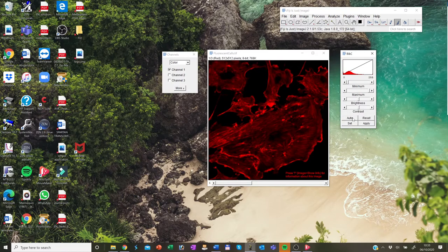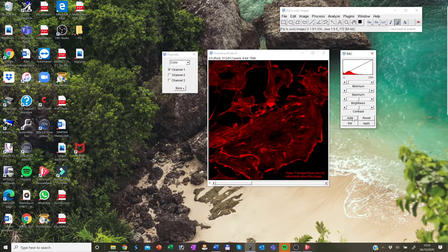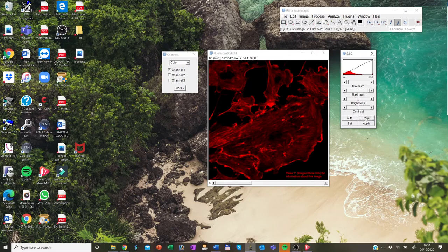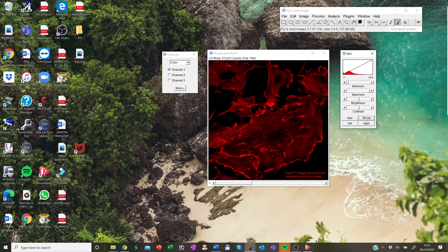If you click on auto, ImageJ will automatically optimize brightness and contrast based on an analysis of the images histogram. If you click on reset, it will restore the original brightness and contrast settings. If you click on set, then you need to enter the minimum and maximum display range values in the dialog box and then click OK.